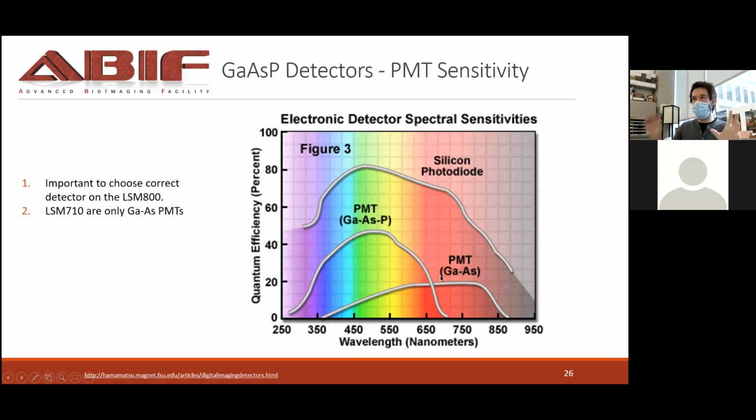And so if you're deciding which target to use with which fluorophore, you might want to keep this in mind. If something is very dim or very lowly expressed, it might not be ideal to use the far red. If you can swap it with something else, use the far red for something a little bit more structural and more densely labeled and things like that. So just stuff to be aware of.